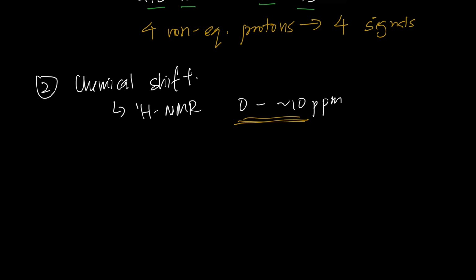And whether the chemical shift value is small or great depends on the shielding and de-shielding effect. This is what we are going to see later. This shielding or de-shielding effect will affect the chemical shift value.